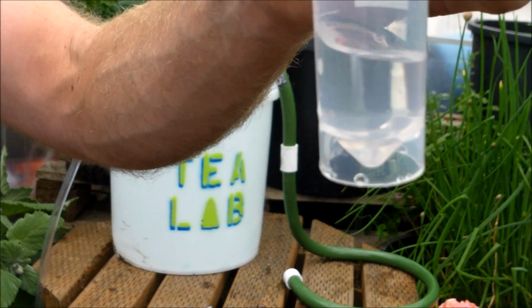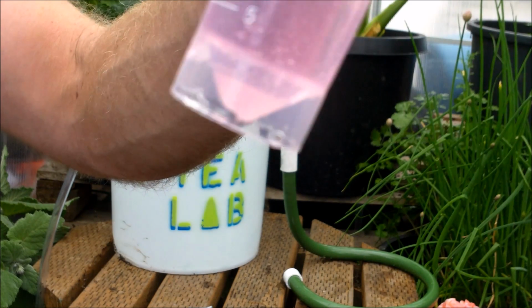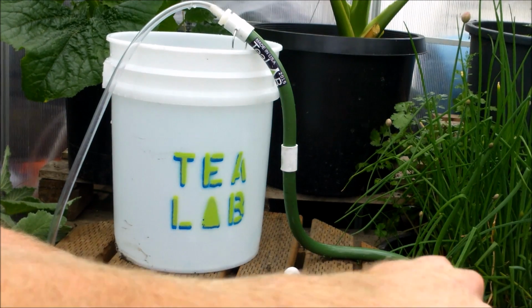So check it out. I'm going to dump one of these packets into about 15 mils of water, and it's really clear right off the bat. Yeah, it's got a cool color change. That tells us there's plenty of chlorine in there. So this is the sort of stuff you want to bubble and get your chlorine out so you can make a better compost tea.